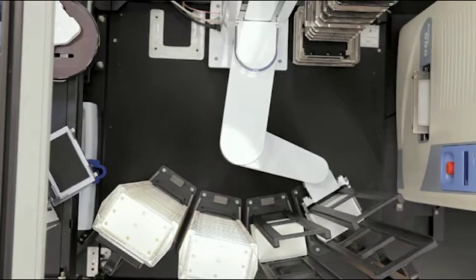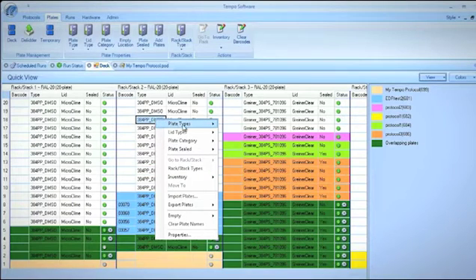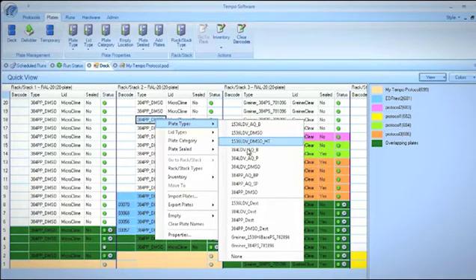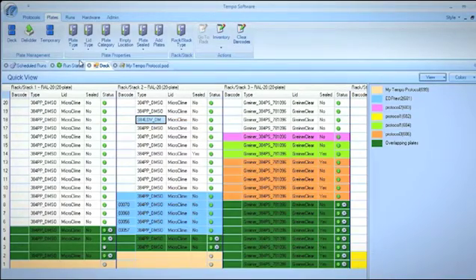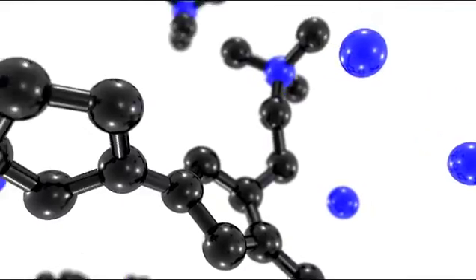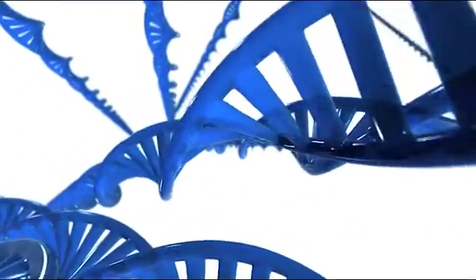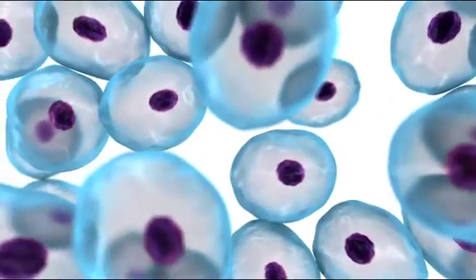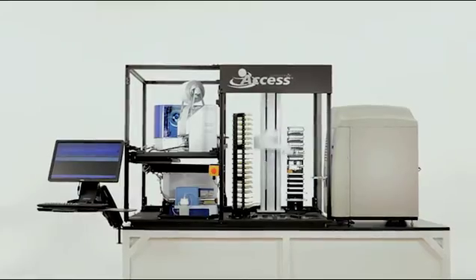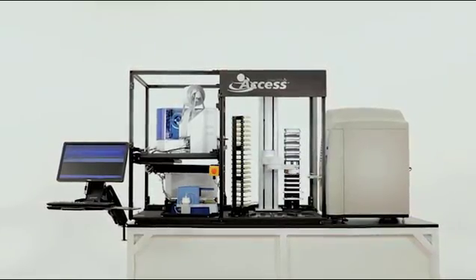Labsight combines their industry-leading software applications with a powerfully simple automation control interface, allowing you to save time and costs immediately. Labsight's commitment to delivering targeted, dynamic solutions to advanced life science applications continues with the Access workstation. Labsight: the future of automation is sound.